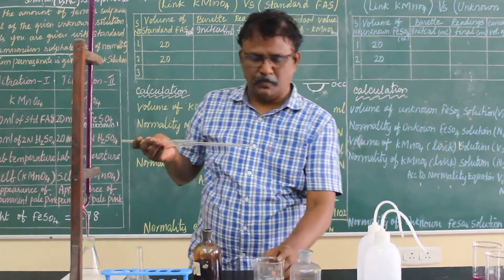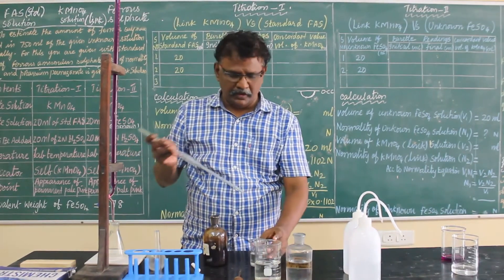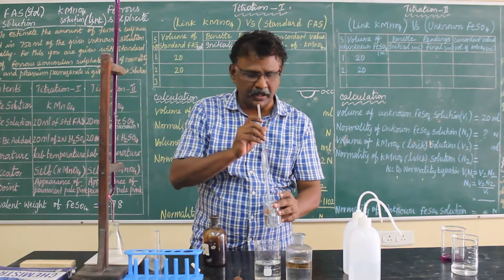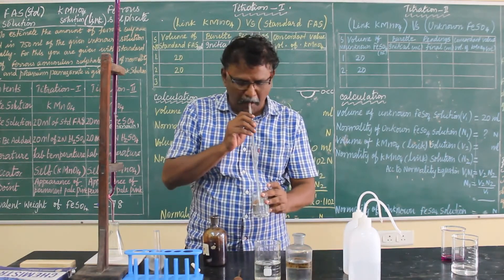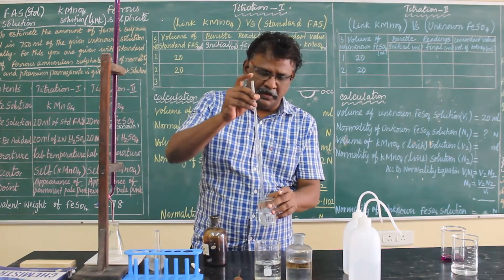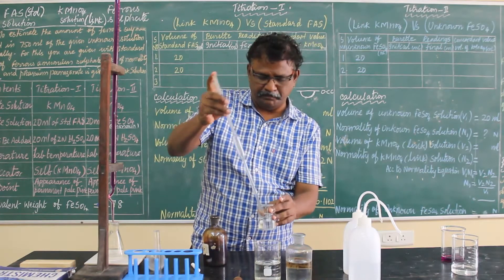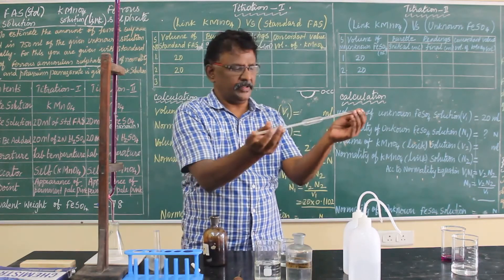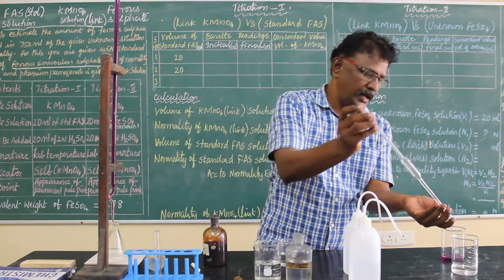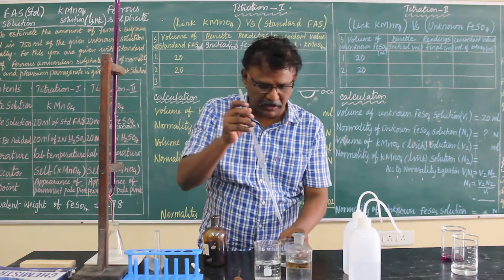The small beaker contains ferrous ammonium sulfate, so I am going to pipette out 20 ml of the solution from the beaker to the conical flask. Before that, we have to rinse the pipette with ferrous ammonium sulfate — the same way you rinsed with water. Rinse with a little amount of ferrous ammonium sulfate and pour it into the sink. Now you are preparing the solution carefully.